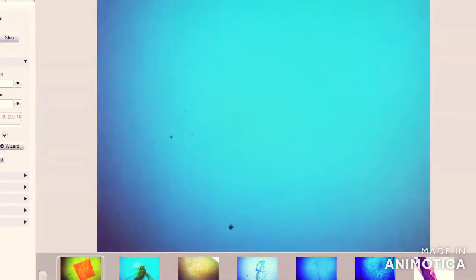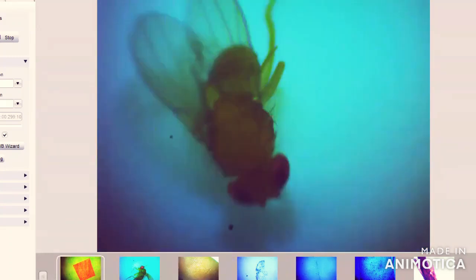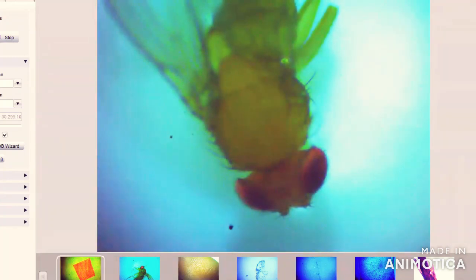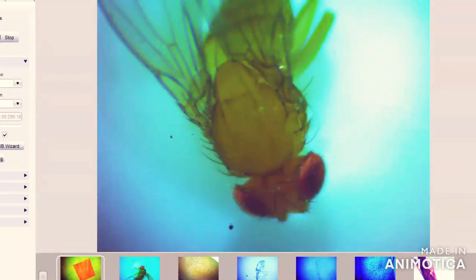If I try to focus on another one that is in close proximity, here you can see this one from the front dorsal view. It's also wild type red-eyed Drosophila. Drosophila means the dew lover. They normally prefer to live in the moisture.